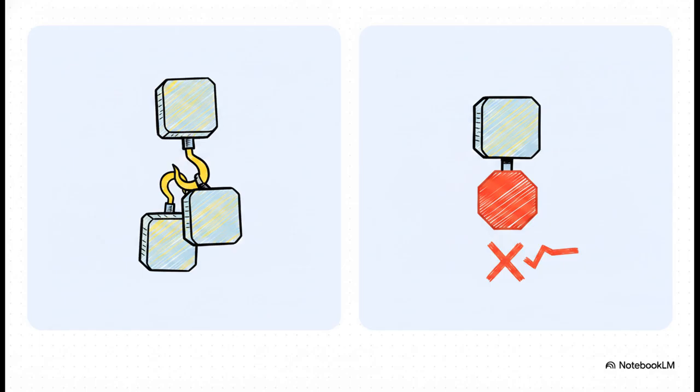Standard dNTPs possess a 3' hydroxyl group. You can just think of this as a chemical hook that allows the chain to keep growing. When the polymerase enzyme adds a normal brick, the hook is right there, ready to grab the next one. But those modified ddNTPs are fundamentally broken. They lack that 3' hydroxyl group, no hook. So the moment the polymerase enzyme accidentally grabs one of these modified bricks and adds it to the chain, construction hits a brick wall. Boom. It acts as a permanent stop sign that immediately terminates chain elongation.